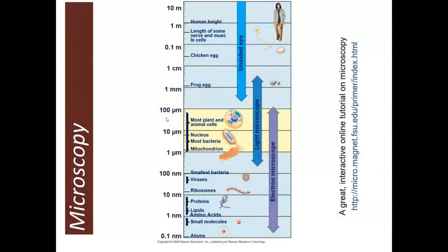Okay, the next part of today's lesson is on microscopy, which is a little tricky because we don't have microscopes to actually look through. So we're going to talk through it a little bit, and then in your lesson, if you haven't already done it for the week, there's a really cool simulation that you can use to pretend that you have a microscope in front of you and you get to use it.